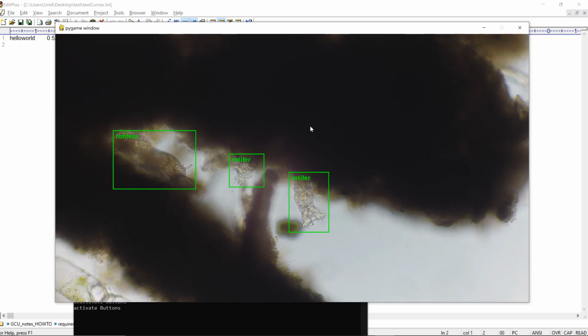What I can do now is to use the right mouse button. By pressing it down, I can hover my mouse on top of whichever label I want to eliminate. And once I'm there, I can lift the right button of the mouse and the box has disappeared. This is useful in two scenarios: when you make mistakes with the label, but also when you mistakenly set the box at a height that doesn't include all of the information on the specimen, which is essential for object detection.